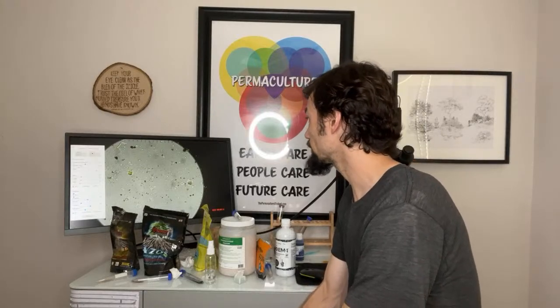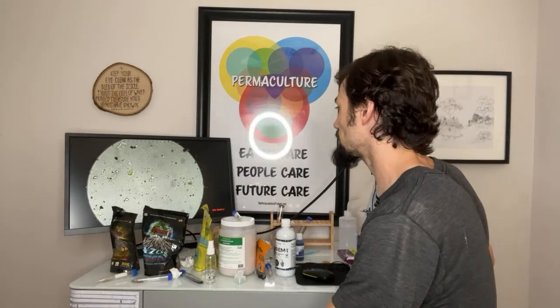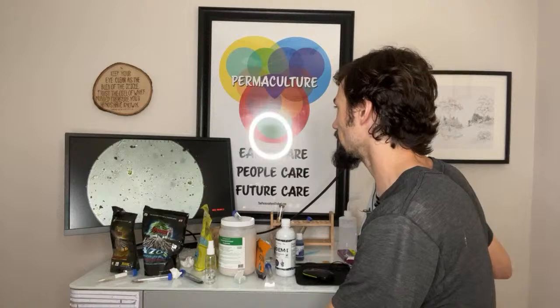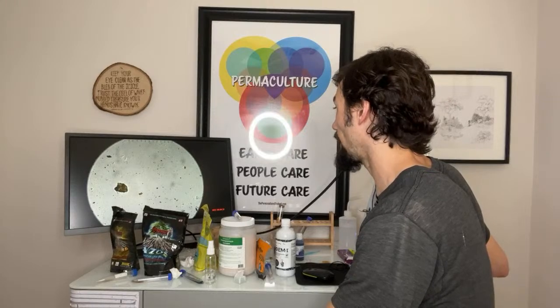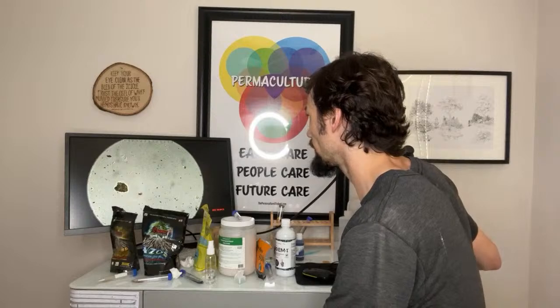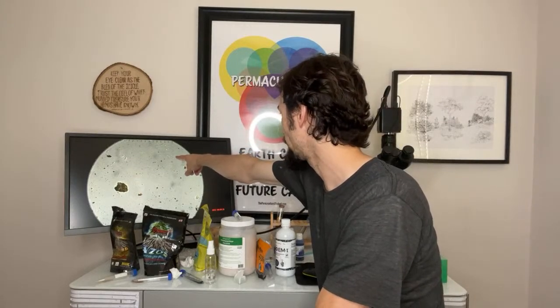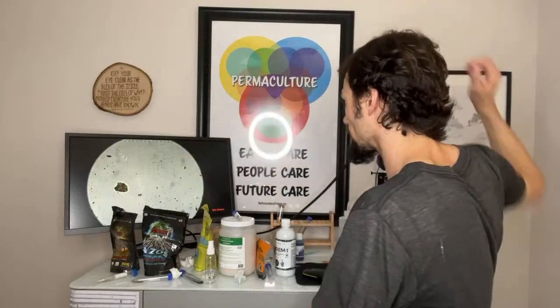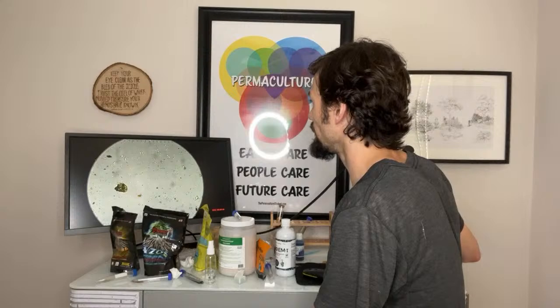Wow, it's just gorgeous. So I'm going to take a picture of a few of these spores and really try to find like a really nice one. And then that'll be the one we post. Wow, there's one spore in here on this one. So that purple guy right there is moving. So I know that's not an effect, but let's zoom in and zoom out and see if it resolves.